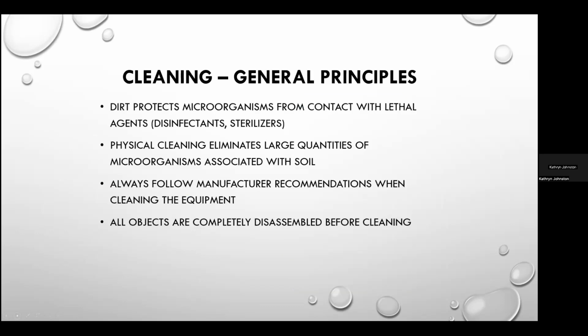There, okay. So the general principles: physical cleaning reduces the bioburden. We talked about that. And I noted that this bioburden, or this organic and inorganic material, protects those organisms from contact with the disinfectants, with the steam or the other chemical, and then it renders the process ineffective or less effective. But you should always follow manufacturer recommendations when cleaning.